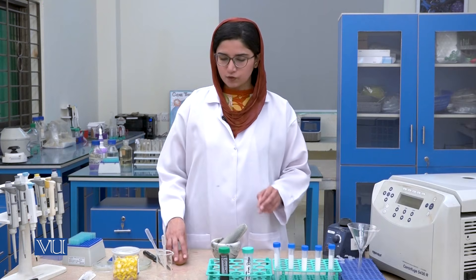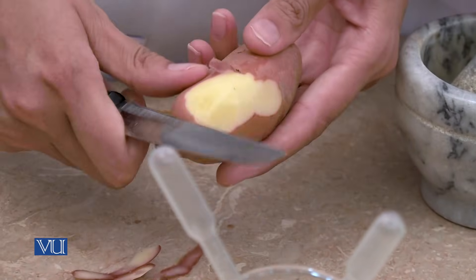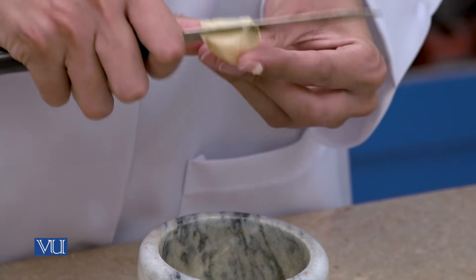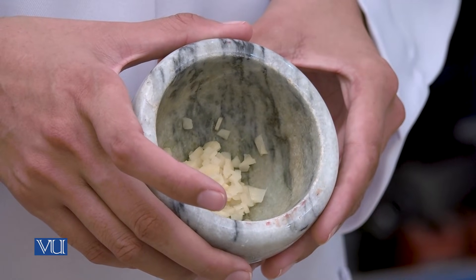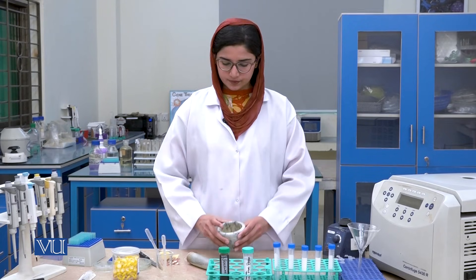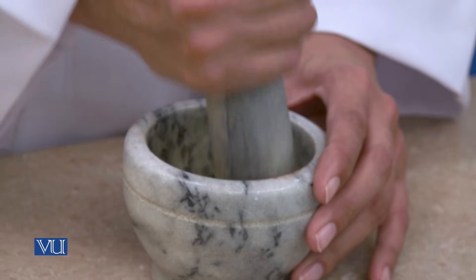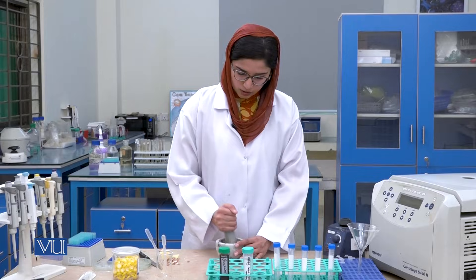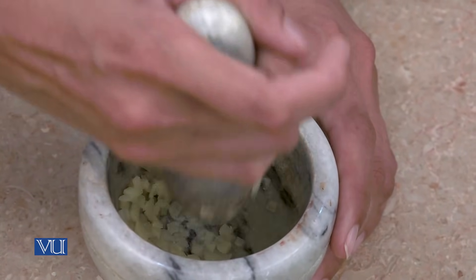To start our experiment, first we will peel the potato and cut it into very small pieces. After cutting the potato into small pieces, we will grind these pieces with the help of a pestle in the mortar. When we grind these potato pieces, we are actually extracting the starch. The purpose of grinding these pieces is to extract the starch so that we can isolate amylose and amylopectin, the major polymers of starch.